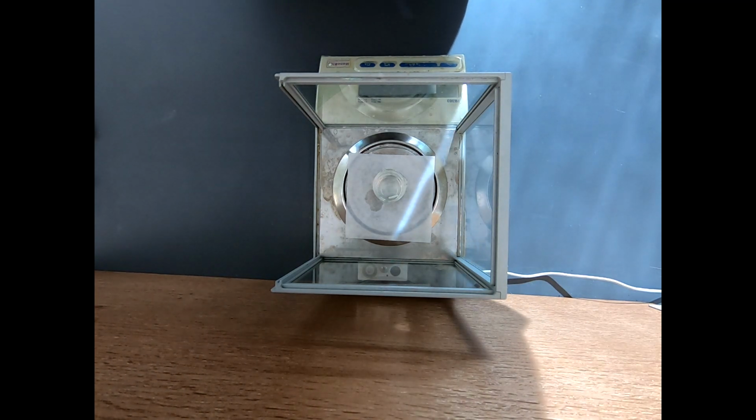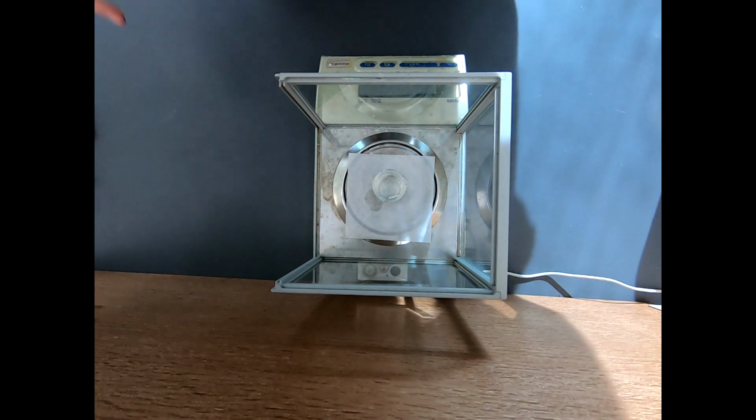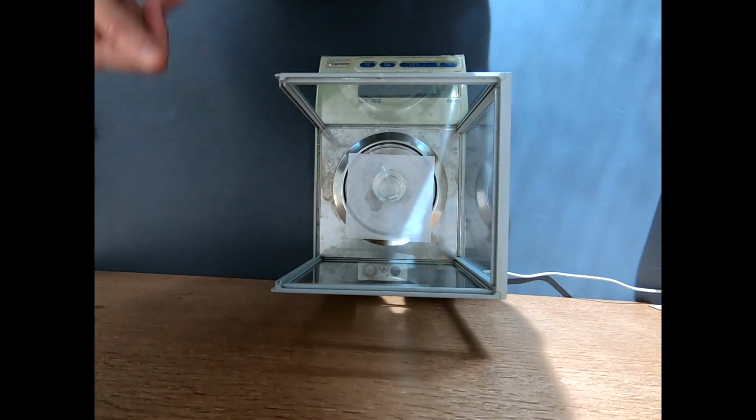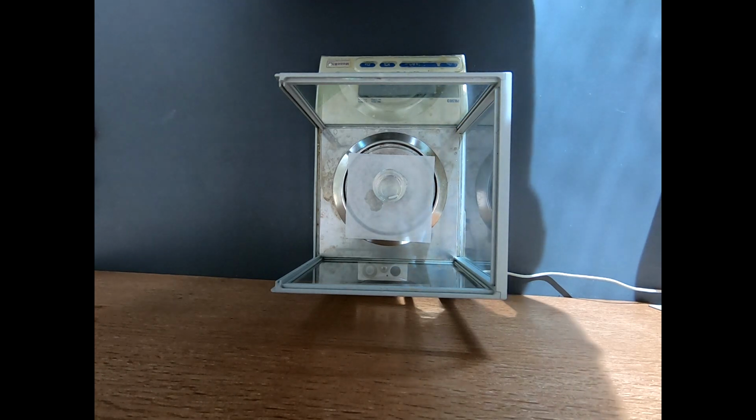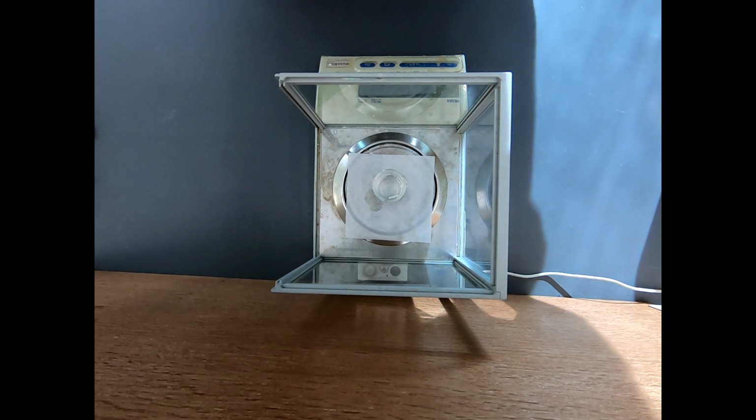6.517, we'll call that 6.52, which is a touch over, but that won't be a problem at all. And note, it's a little over. I also lost a drop here, so we'll still call that 6.52. And now we're done dispensing these two reagents. The third reagent I will add once it goes in the hood.